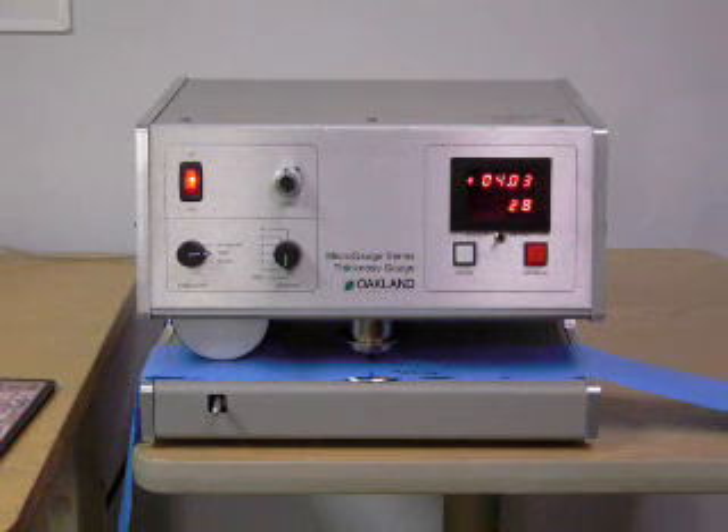Caliper or thickness testing is used in product development or quality control to measure the cross web or down web thickness profile of plastic film, paper, tissue, and sheeting materials.